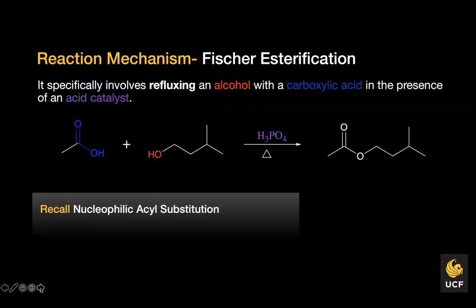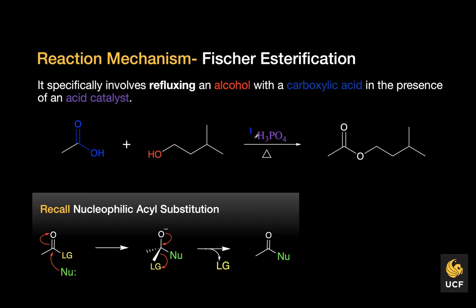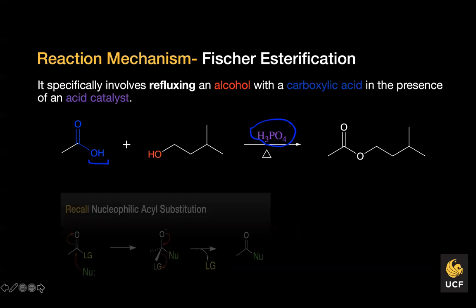And if you recall from last lab, the mechanism involved a nucleophilic acyl substitution reaction. You might notice that the mechanism is somewhat similar, where we have a nucleophile attacking a carbonyl group, and then we have a leaving group. The only thing to keep in mind is that we're starting with an acid in this case, so we protonate first, and then we do have a leaving group, right? Water will be one of our leaving groups in this case. Okay, so somewhat similar, but doesn't necessarily follow the same exact mechanism.